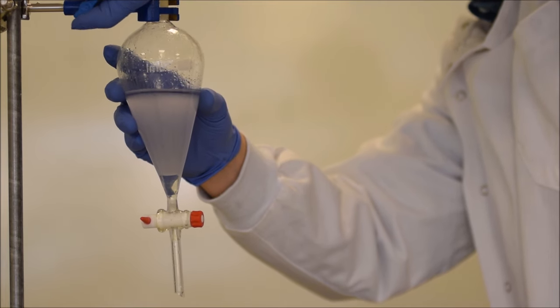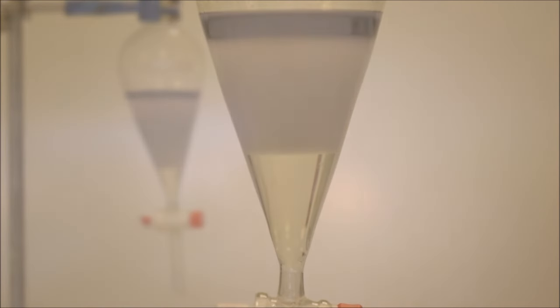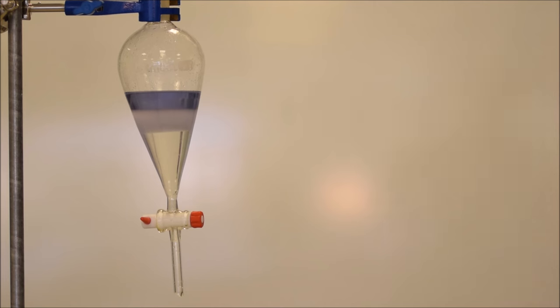And again, I will speed it up just for the sake of time, but you can see that they form nearly an emulsion. Sometimes this is a real problem in organic chemistry, and you have to do things like add salt or add a little bit of acetone. In our case though, we're just going to wait for it to happen and we can speed it up.